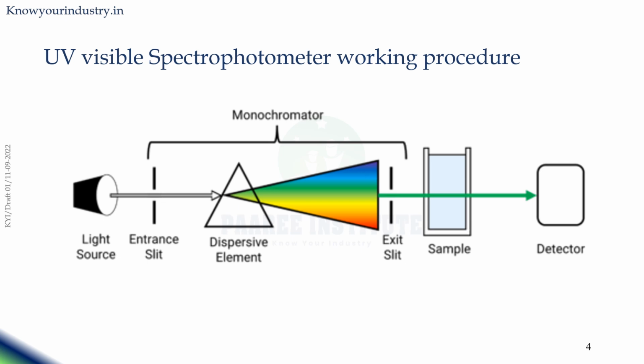In this particular slide, we are seeing the different parts of a UV visible spectrophotometer schematically.